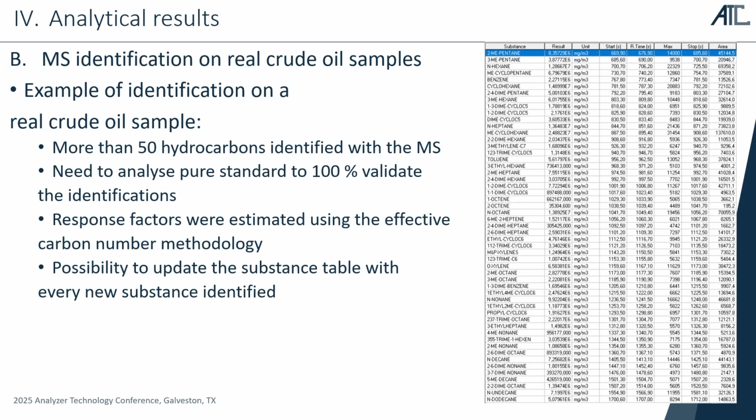So that's a strong feature, because on the field you cannot have the 50 hydrocarbons you identify on this sample to calibrate. And then after this work is done, we can easily update the substance table, and automatically these compounds will be monitored and quantified every cycle.